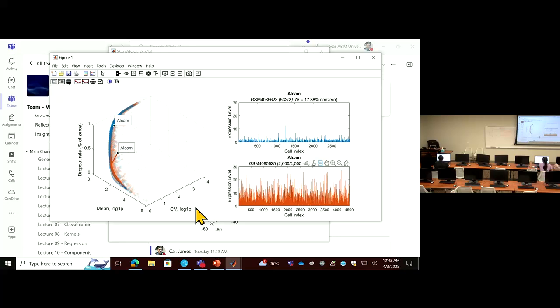So this may not be enough. We don't have enough cells to play. So what you can do is just download a new one. Download the one I just prepared in the channel. Do you have this?